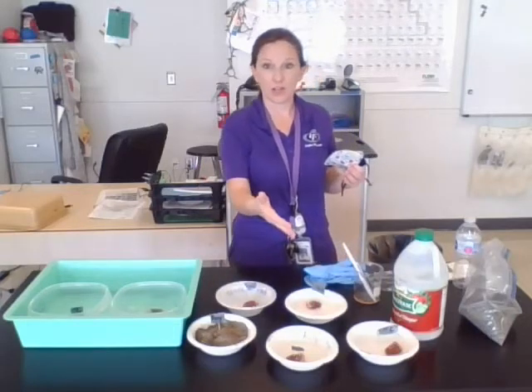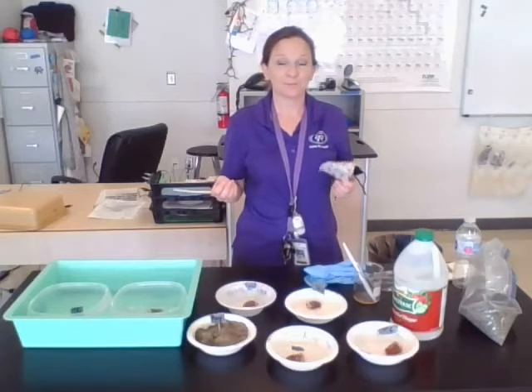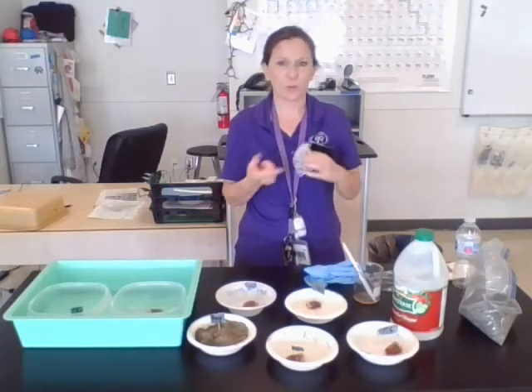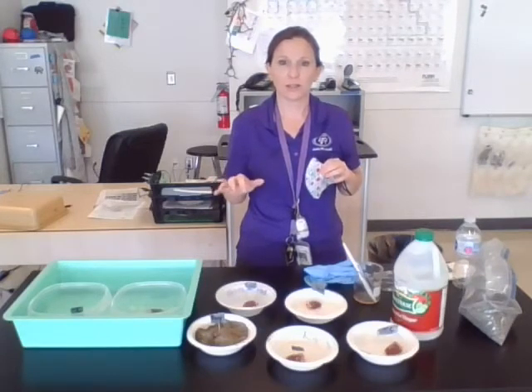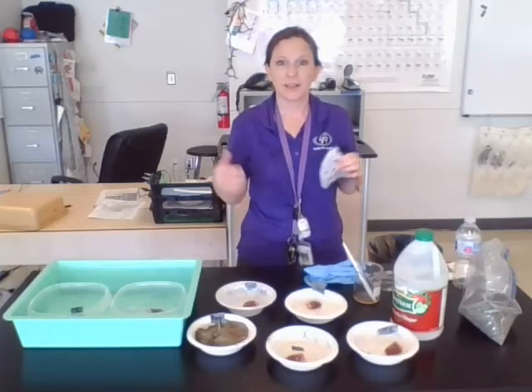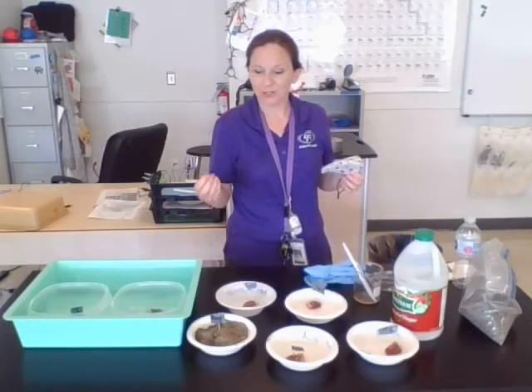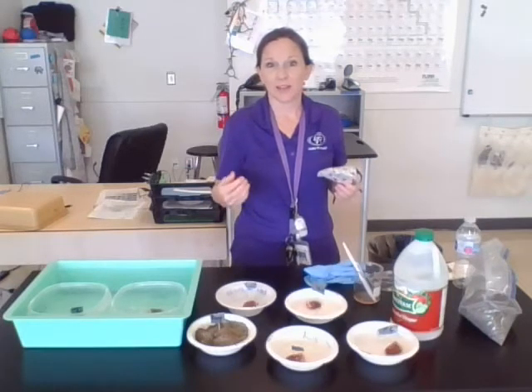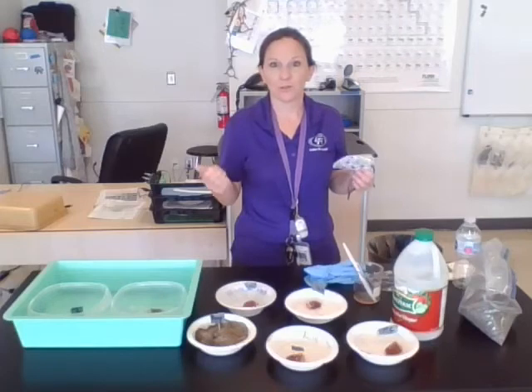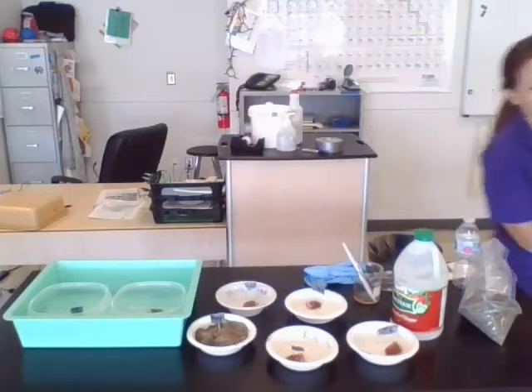Is it because it was in the shade versus in the sun? Maybe there's more or less insects. We'll be able to determine the age of the insects. So we want to determine the species that show up and the age of the insects — that's kind of what our goal is every time we go out to check on these. If we do have any insects that we find, we're going to collect some so we can identify them. We'll be using some digital microscopes so that you guys can see up close what exactly these insects look like.